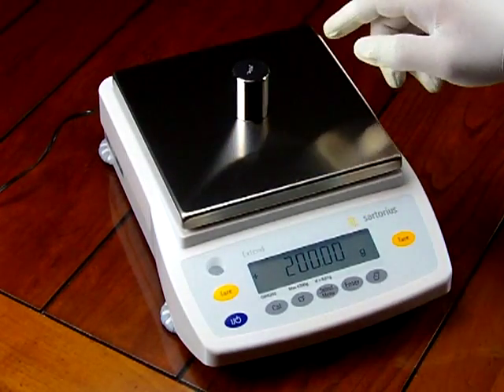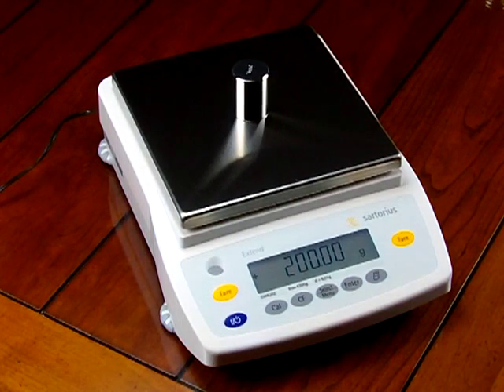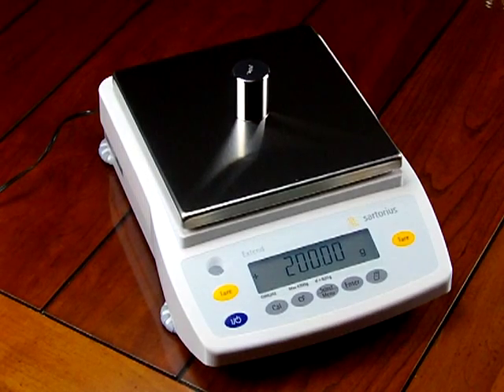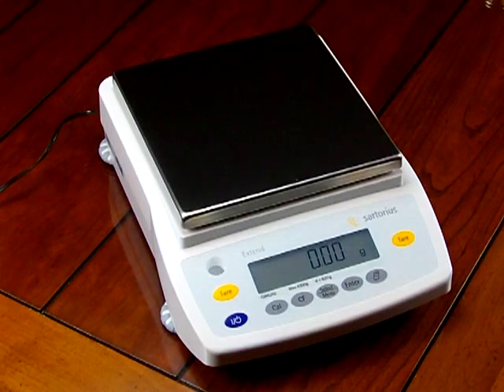Some of the other features the balance has to offer: you can set it in multiple languages. If you have staff that speak German, French, Italian, Spanish, Russian, or Polish, the balance can be configured. Simply go into the menu — this balance is extremely intuitive.